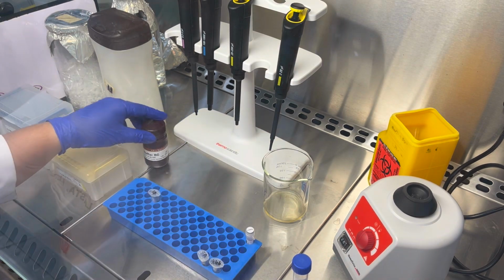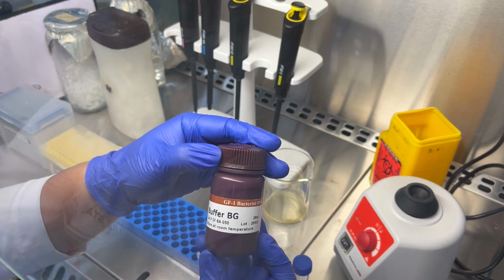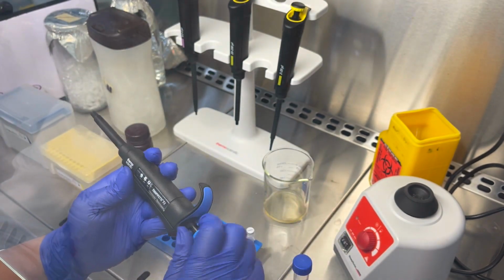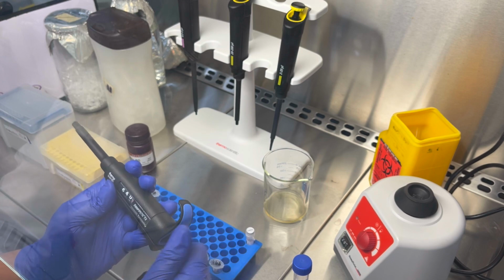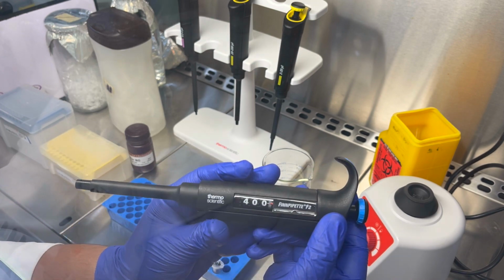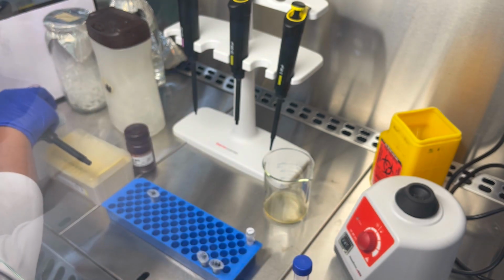After the enzyme treatment, we will add another buffer, which is buffer BG. This will help homogenize the solution, which in this step we can now call a lysate. A lysate is a solution that contains lysed cells and their products. 400 UL of the buffer will be added to our lysate.